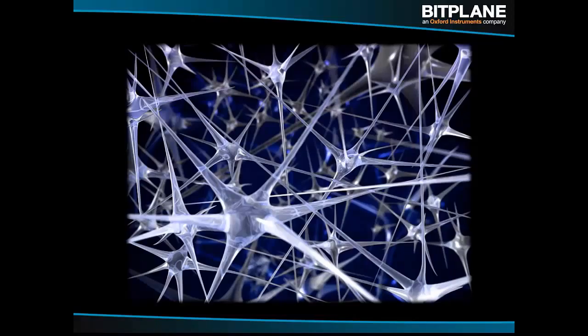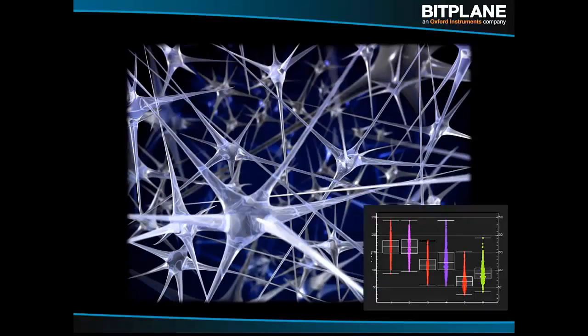So the real value, as I was saying, is in getting good information out of a complex situation. And this plot on the bottom right here is a plot created in Imaris 8.1, and it's a 1D vantage plot.